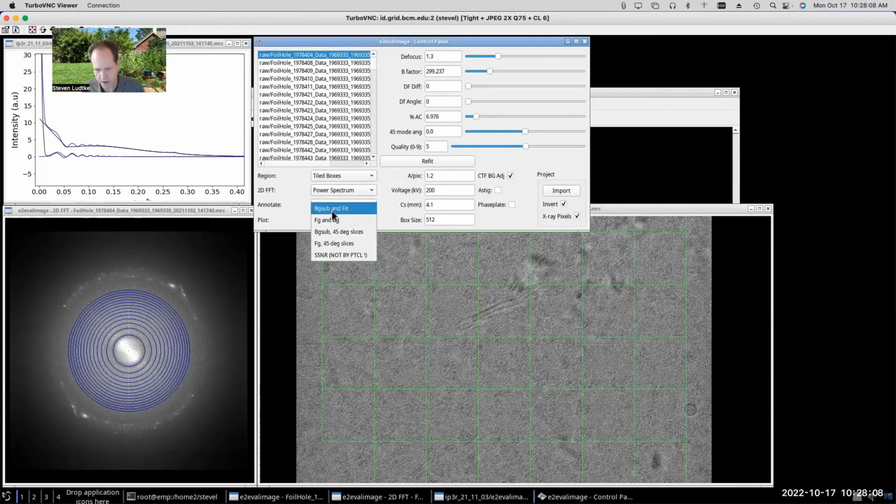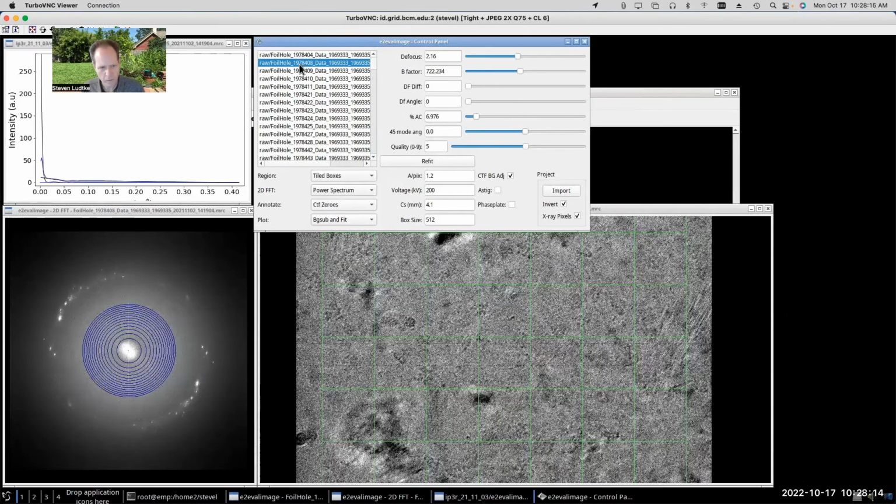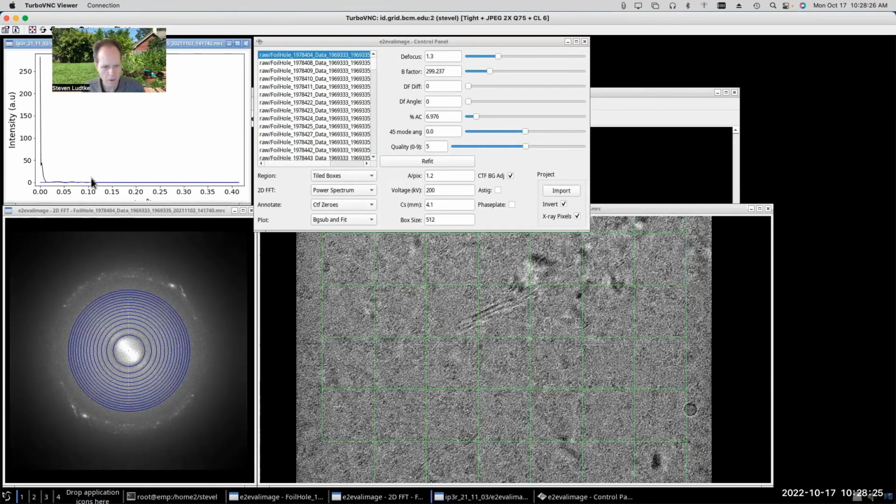So let me go ahead and turn that off, and we'll go back and look at this again. Let me see if it goes away. I'll turn it off this way. Let me zoom back in.